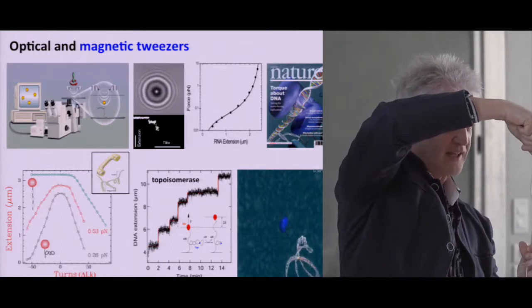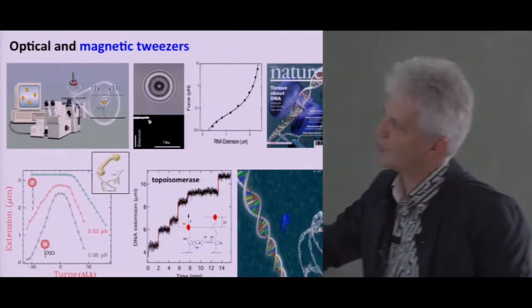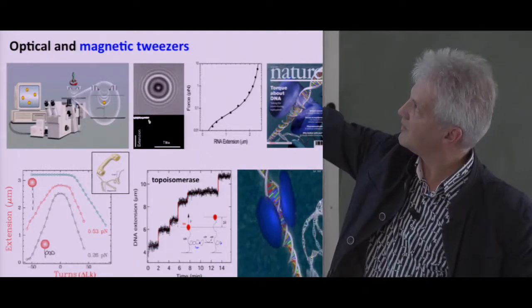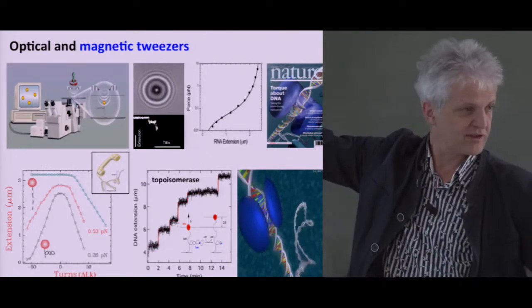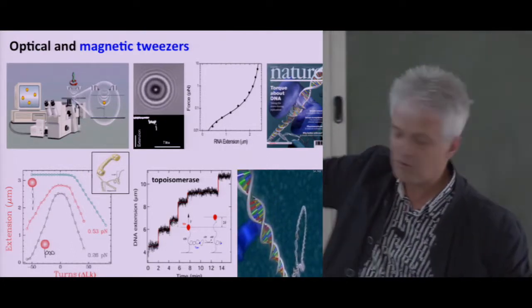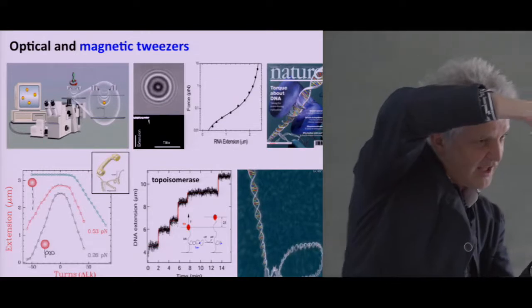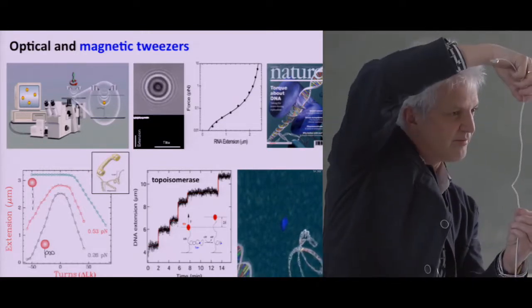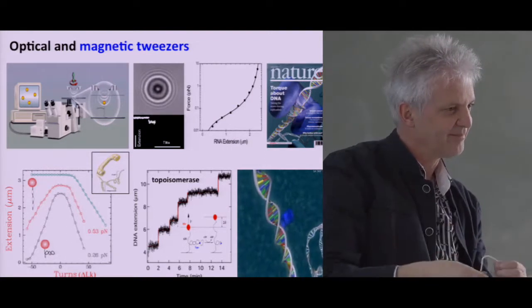Now we throw in the enzyme, and then this action occurs as in this cartoon movie, where an enzyme will bind the DNA, cut one of the two strands, swivel about it, and religate that strand. Since you did something here, the number of coils has relaxed, and therefore the bead goes up. Get the point? Okay.